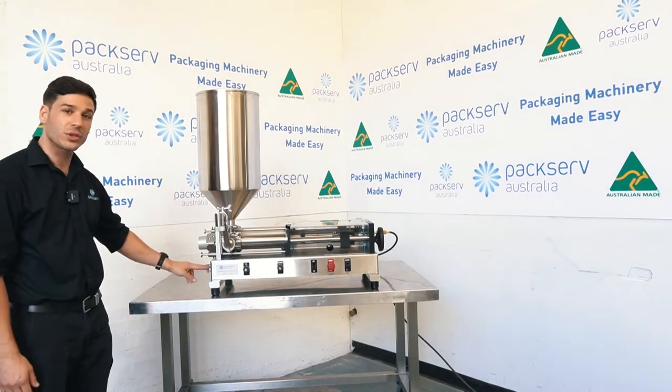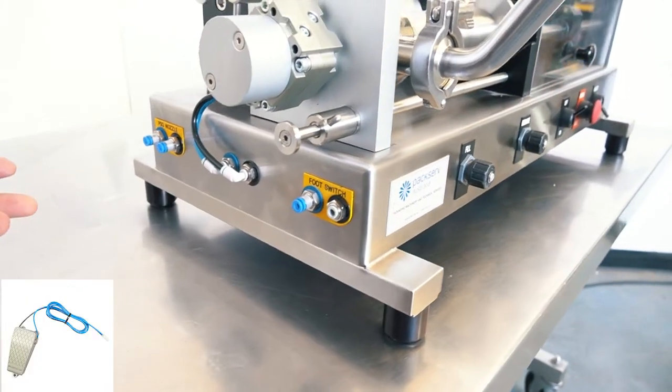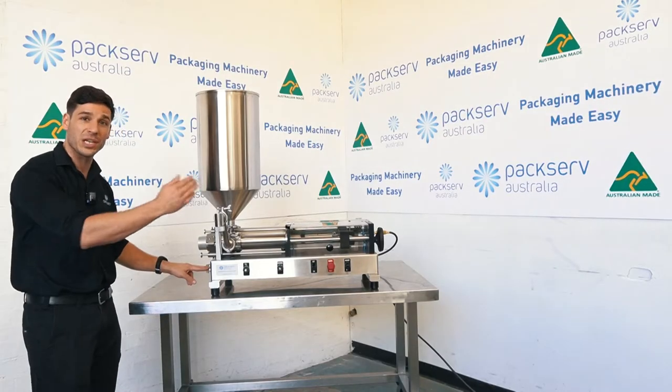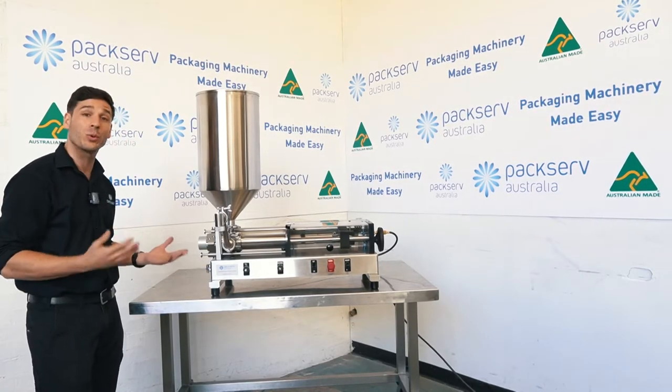On the front you have the foot switch. This is an optional extra which essentially gives the ability to have a foot switch that every time you press it, the machine will operate. It just makes it a little more user friendly.